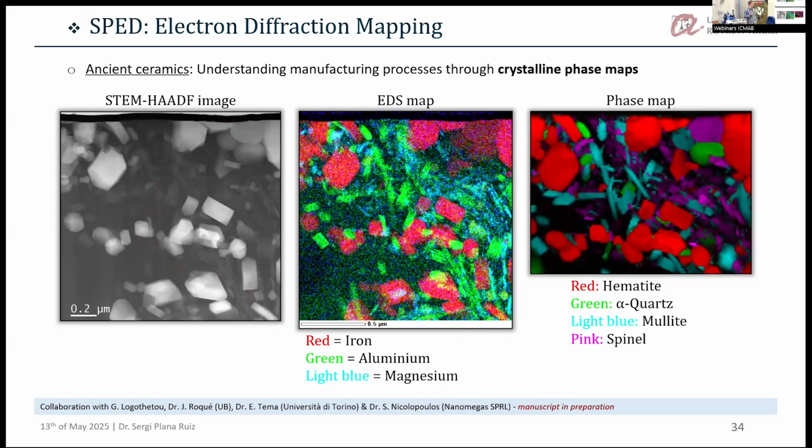Once again, we need to know beforehand which phases we have. However, there is an outlier here, which is this one up to the top. There, we can see that the program has identified these three different materials in this area. We don't have iron here. Apparently, if we look at the other EDS maps, we could see that there is titanium there, but we didn't know which phase.